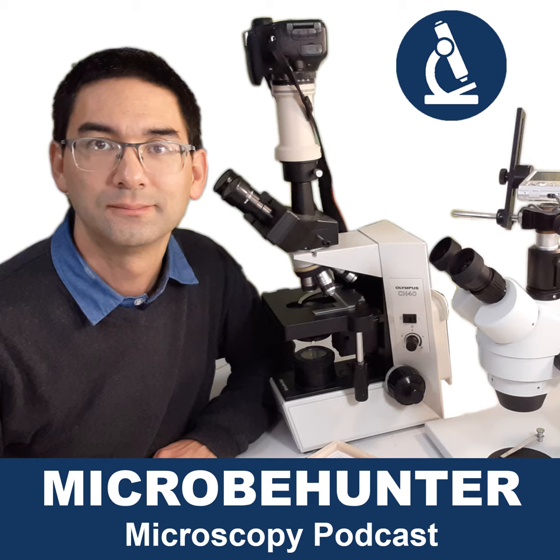Yeah? Mistake number 1, turning the microscope on with the lamp set too high. So this is actually mostly a problem with microscopes that have a halogen light bulb. And let's say you have turned the light intensity all the way to high, and then you switch the microscope off, and the next person who switches it on will receive very bright light, but maybe only for the fraction of a second, because usually this is the time when the light bulb starts to break and burn out.